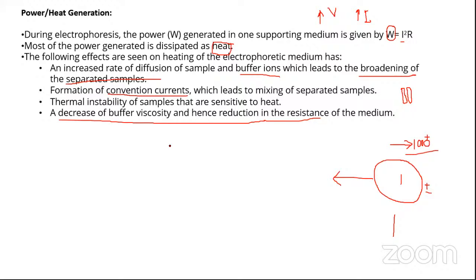No, you will not get good separation, Janki. You will not get good separation just because with increase in voltage, everything has actually changed. You have increased the concentration of buffer ions, so there is no charge now available to be carried by sample ions. Imagine, these are quite fast, right?